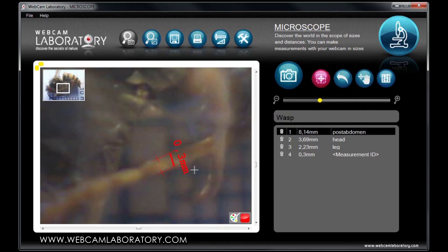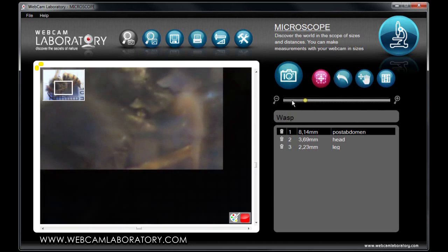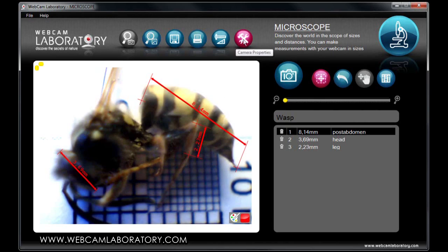If a measurement is not successful, you can use the undo button to cancel it. If you wish, you can change the picture parameters on the right-hand side. On the side of the top panel, the camera properties button can be used to set the camera parameters.